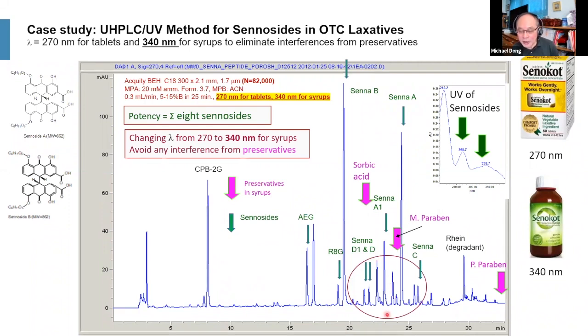Now, this actually is a very nice separation. It's using an HPLC column, this particular column coming from Waters Corporation, with 80,000 plates. It is definitely a single column. It is 30 centimeters long, 2.1 millimeter ID, packed with sub-2 micron particles. It's very long and gives you very good separation. However, the back pressure is very high, so I can only use 0.3 mL per minute. So this is definitely using HPLC to the max to give you very high resolution.